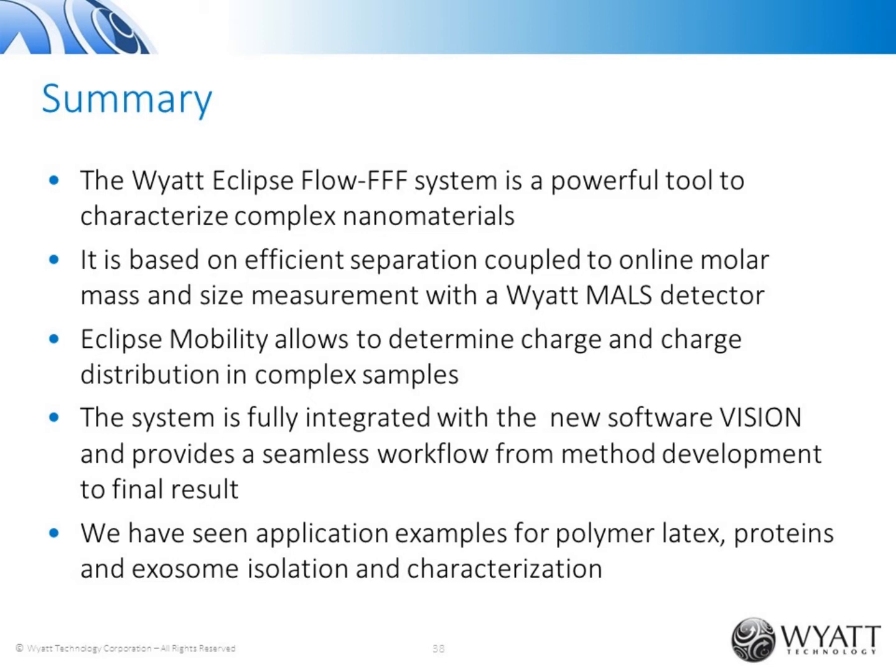Yeah, AF4 separates. So I don't quite understand that question. So we can separate. We can also, of course, if you have, let's say, a colloidal particle, nanoparticle, you're adding a polymer. So you put it on the surface so that structure becomes bigger. We can separate the uncoated and coated particle, and we can see a shift in retention time and also see a change in charge if we modify our sample by, for instance, adding a polymer on a particle. I don't know if that was the question.